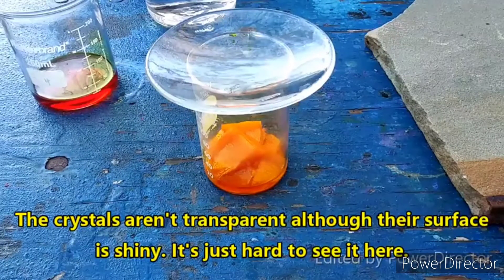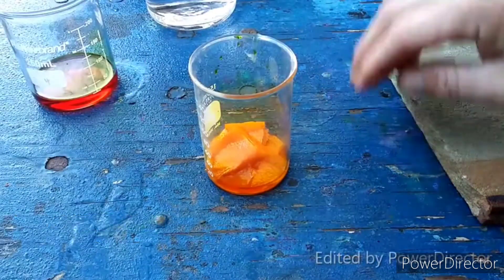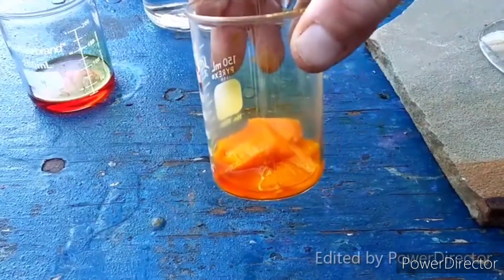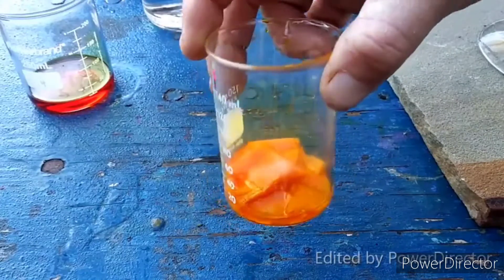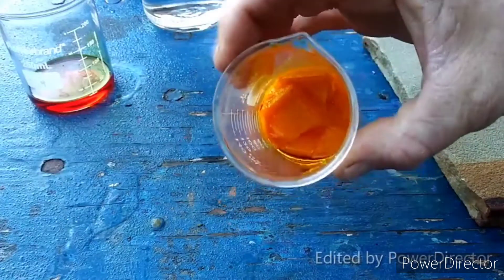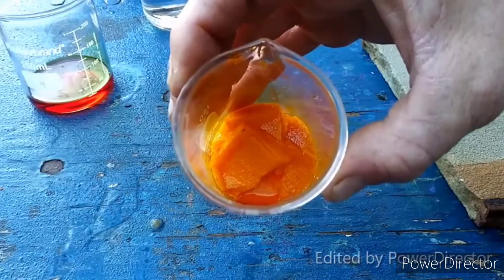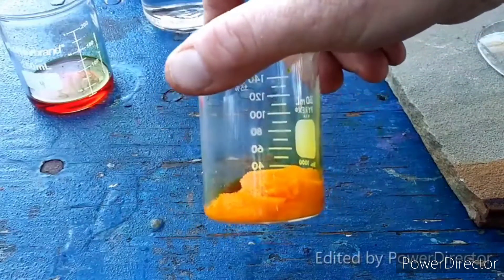I couldn't get a time lapse of the crystallization because it takes a long time, but look at that — this is the recrystallized product right here. Look at the size of those crystals. Those are huge. They grew overnight last night — that is fucking wild. Nice top-down view there. Those things are massive. You can see they grew out from around the stir bar — that's where it all started.